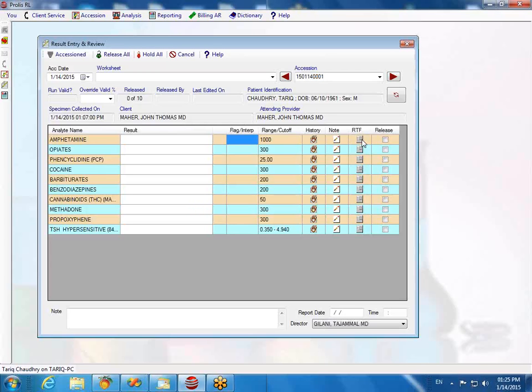You could enter unlimited text under this function, and you could even add the images of the results. Okay, got you. Because sometimes the laboratories for certain tests like FISH, those laboratories want to store the slide images. Yeah. Like I said, it's an advanced feature, so I don't think you are going to use it. Okay. But if you need to use it somehow in future, we are here to help you how to use it.